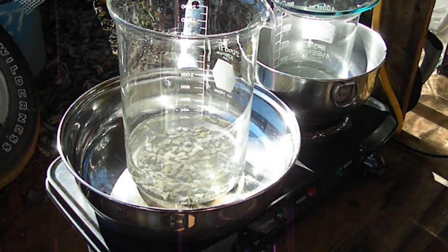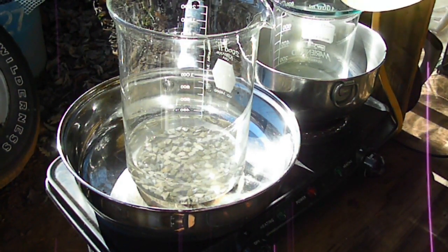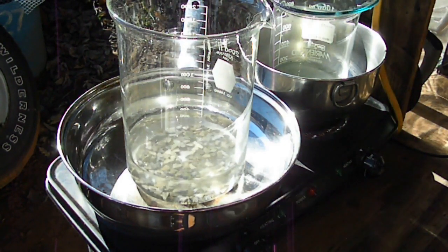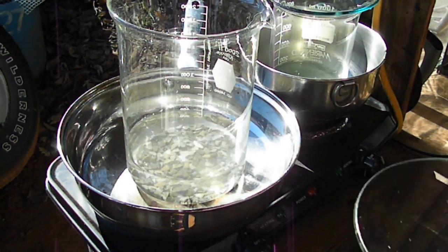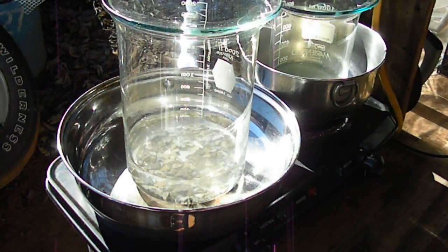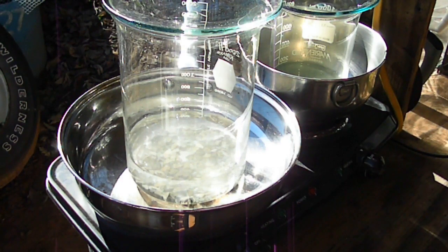And I do love pouring acids out of these beakers. I hate pouring them out of the bottle. I mean, I got to pour it out of the bottle to get it in here, but once it's out of that bottle, I like putting it away. I've said it a million times, I don't know why they can't make something that's so nasty like nitric acid and put it in a bottle that doesn't drip when you pour it. I mean, that just doesn't make any sense. Yet they'll make whiskey bottles and syrup bottles and every other kind of bottle that doesn't drip, but not a nitric acid bottle.